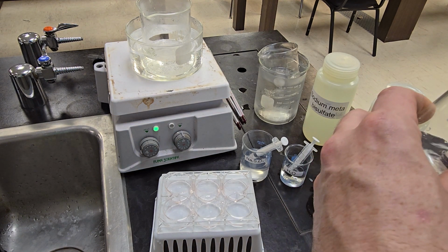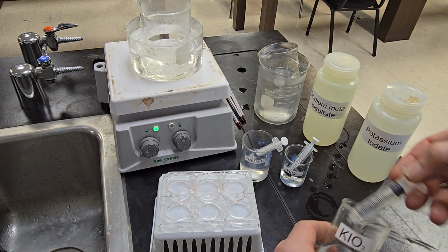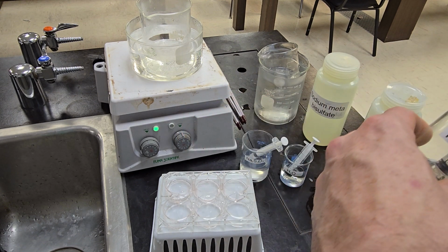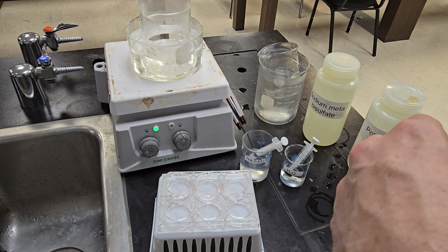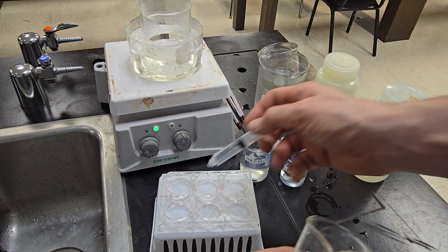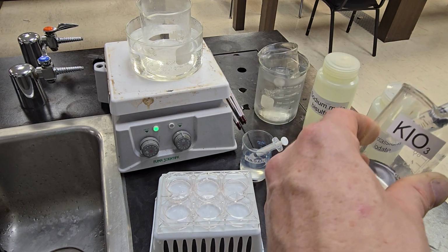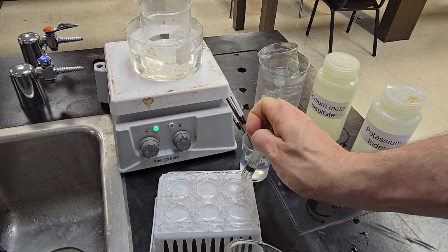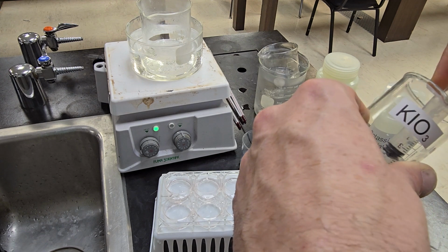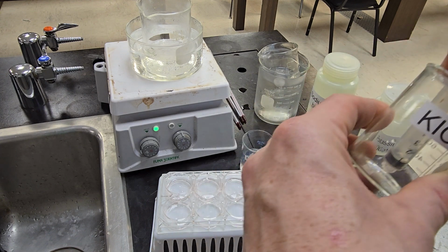I need 5 milliliters in my first well of potassium iodate. 5 milliliters. And then I go 4, 3, 2, and 1.